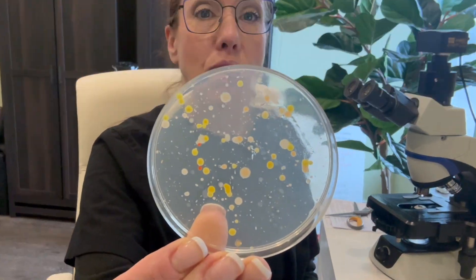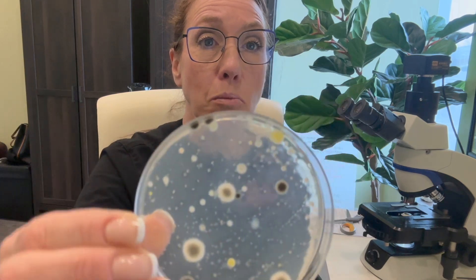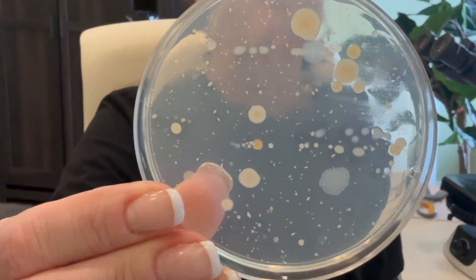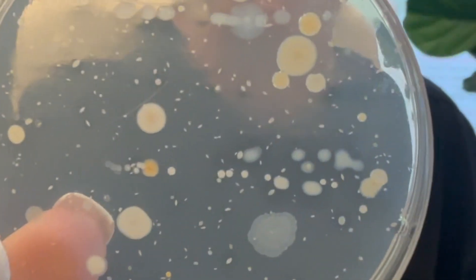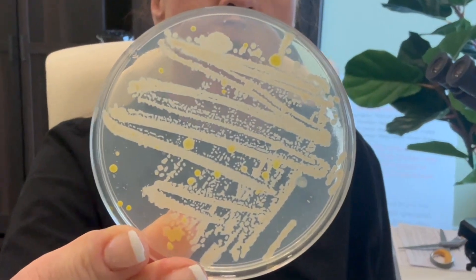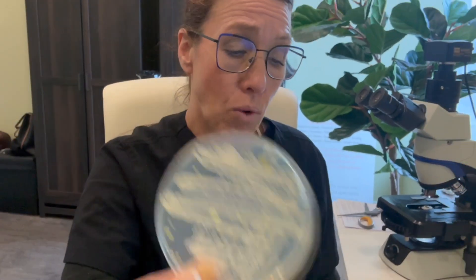I'm going to show you a few of what they look like on camera here instead of zoomed in. Here's the one that grew the most interesting things — you can see the red bacteria, which I did show earlier as well. Here's the one that is growing a little bit of black mold and a little bit of green mold. I do believe some of the green mold is very common on cell phones because it's also facial oils or facial bacteria or molds. As I zoom in here, we're seeing very common bacteria but it's quite large and sporadic through the sample. And this is my phone — I had a lot of different things growing on that as well, but no crazy colors, no molds, which is a great thing to see.